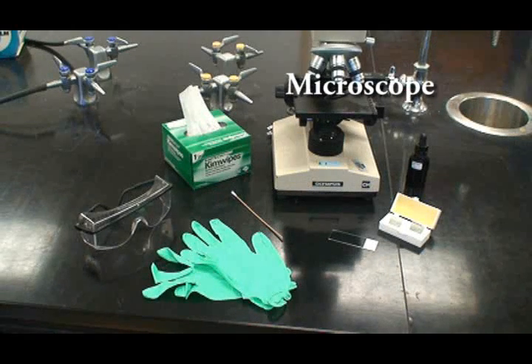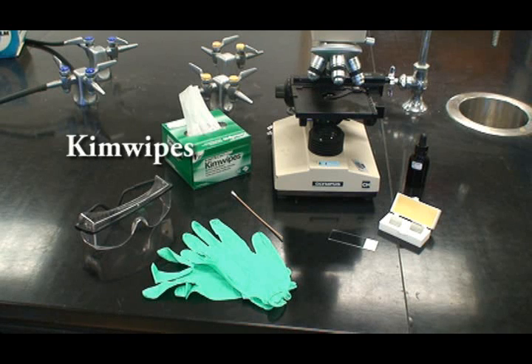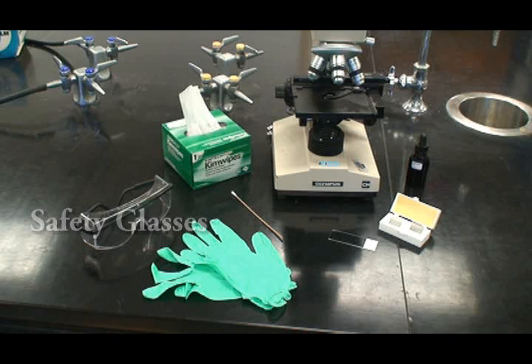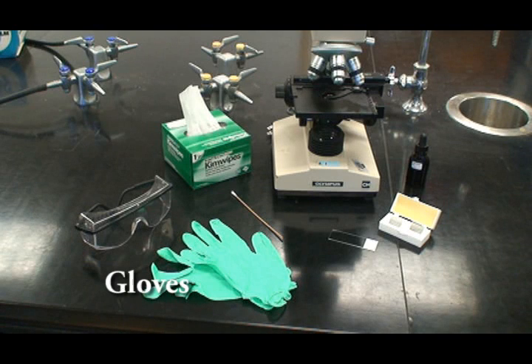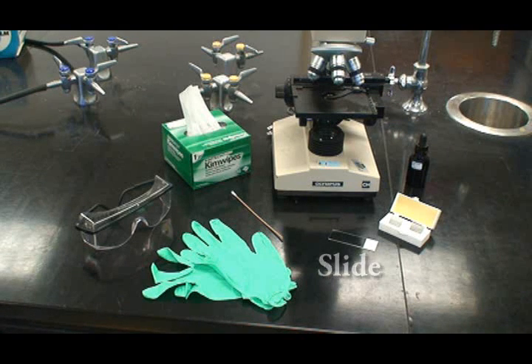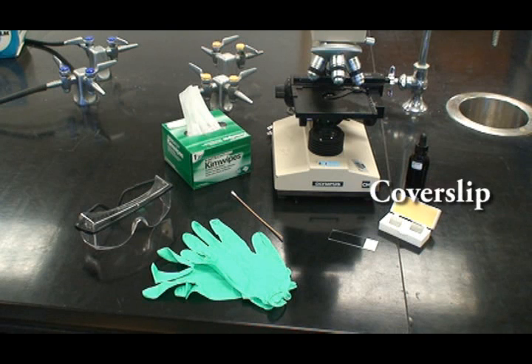For this lab, you will need a microscope, Kim wipes, safety glasses, gloves, a sterile swab, microscope slide, cover slip, and methylene blue.